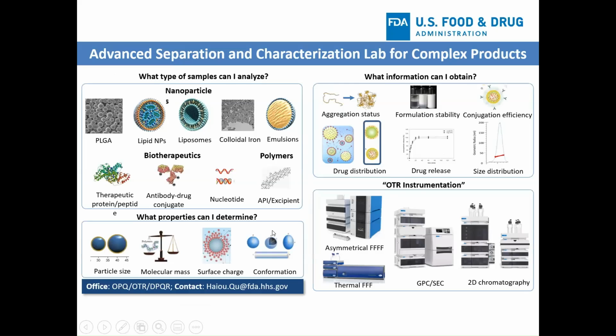So last, I want to use this slide to conclude my presentation. We are building this advanced separation and characterization lab, dedicated to answering questions related to complex drug products. We can analyze a variety of different complex products: lipid particles, liposomes, PLGA, antibodies, therapeutic proteins, nucleotides, and polymeric excipients.